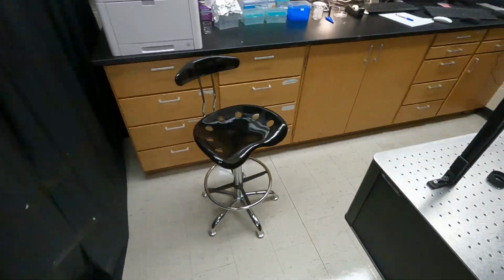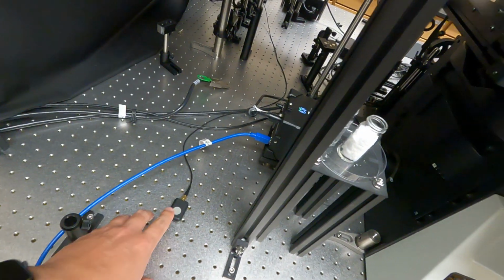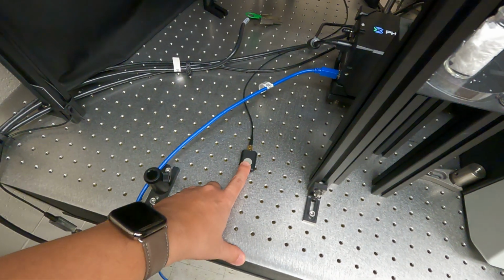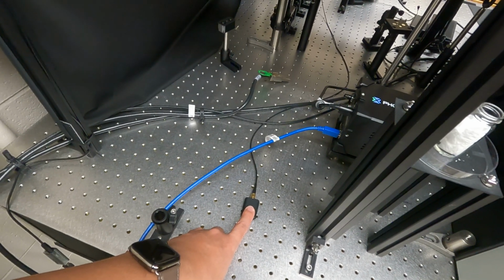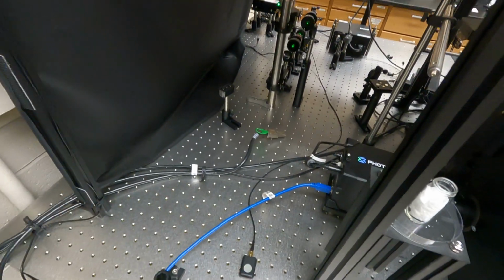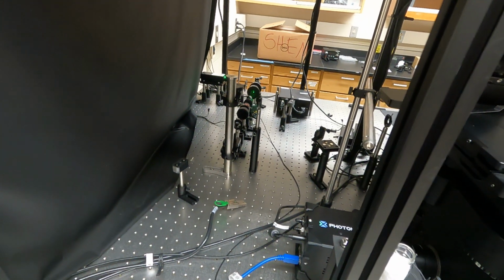There is actually another access to the flipping mirror, which is at the front of the entire microscope table. We have a little remote shutter here, which basically acts the same as the little white knob on top of the flipping mirror. So if you touch it from here, it's going to have the same effect. This rotating mirror is going to flip up and then down if you press this button.